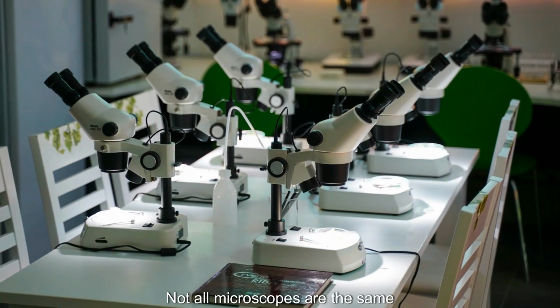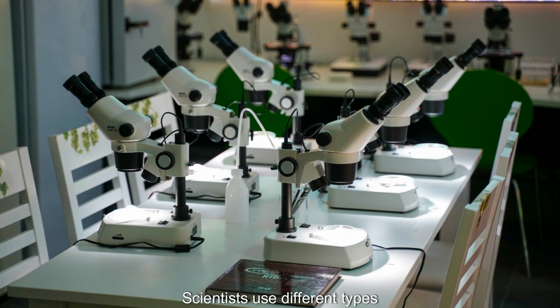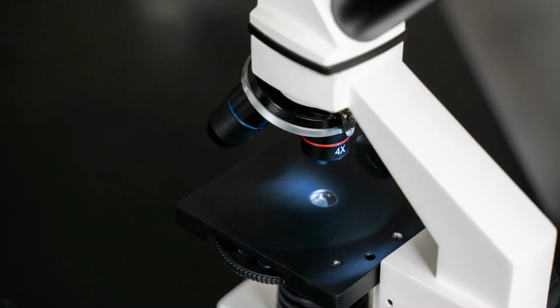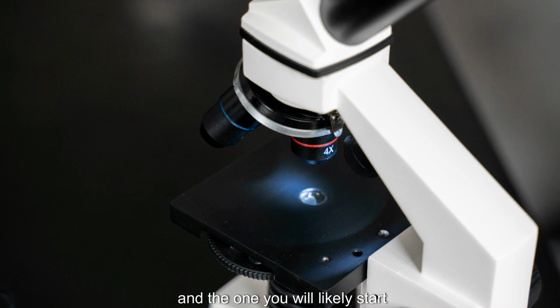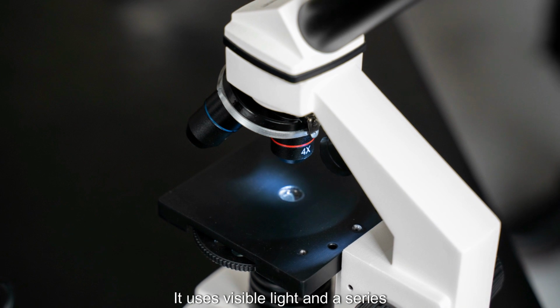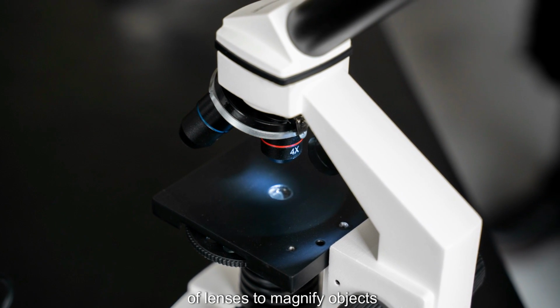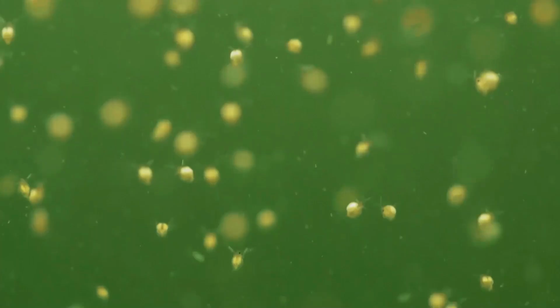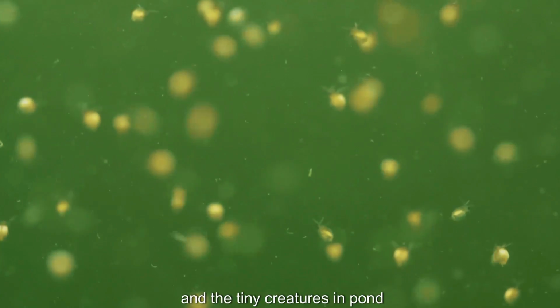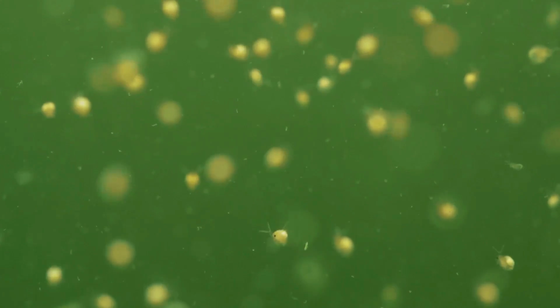Not all microscopes are the same. Scientists use different types of microscopes depending on what they want to see. The most common type, and the one you will likely start with, is the light microscope. It uses visible light and a series of lenses to magnify objects. Light microscopes are wonderful for looking at living cells, bacteria, and the tiny creatures in pond water.